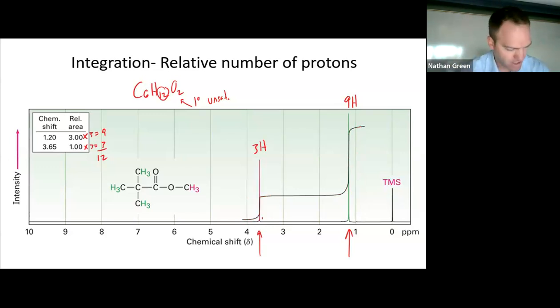I would go and cut very carefully out this signal. So I'd have a sliver of paper that big, and then I'd cut out this signal of paper, or this sample. And I would weigh this. Based on the relative weights of those two things, that's how I would get the integration. So how good your arts and crafts were would determine how well you determined the structure. We've gotten a lot better since then.